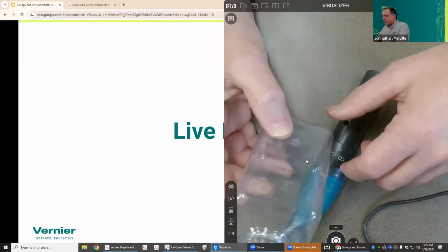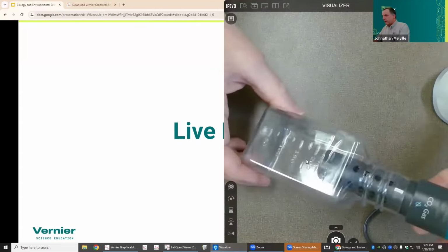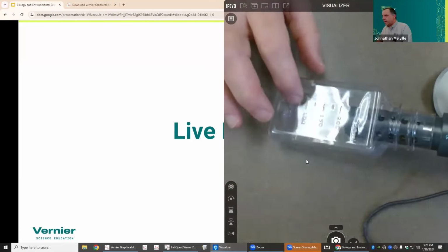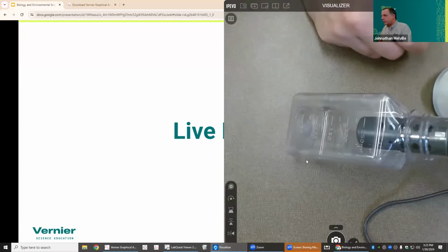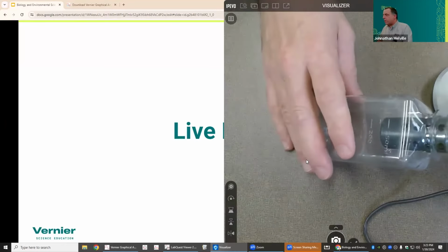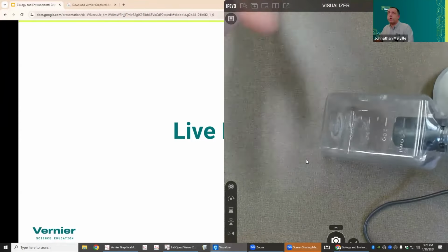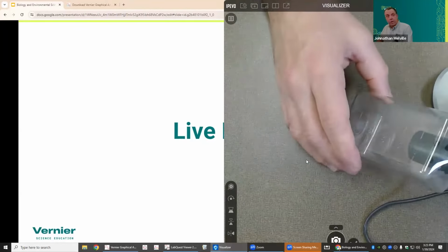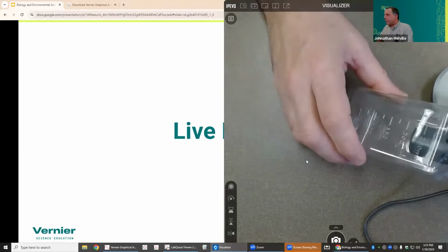The way that I look at yeast respiration is you just take a Nalgene bottle, put the CO2 sensor in it, and then stand it upright. All you need to put in is about 2 to 3 mL of yeast and 2 to 3 mL of sugar suspension, and you will get great respiration rates. There's an entire lab that you can use for that, and you can look at the effect of maltose, sucrose, monosaccharides, disaccharides. If you're interested in that activity, I can show you that. We're also going to be doing a lactose webinar later in the term, in the spring. If you're interested in that, let me know.